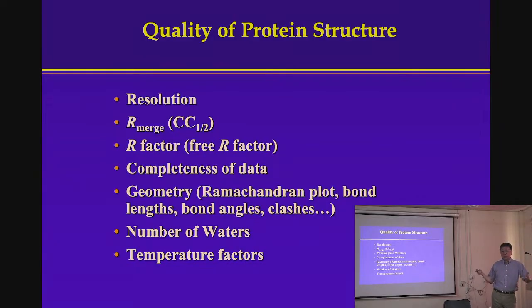As you heard, the higher resolution, the better, but of course that's limited by the quality of the crystal. So don't blame the authors that are going on to 3 angstrom, because that's probably the best they can do after years of effort. That's a major achievement already on its own. But check the number, and then how good the data is, the merged CC1/2, how good the diffraction data is. And then how good the model is, the R factor, and more importantly, the free R factor of the model. And then this I will skip, I didn't explain that.